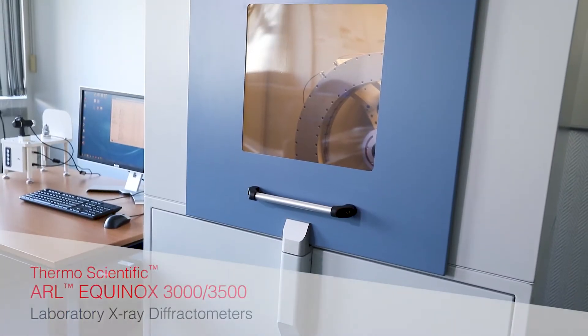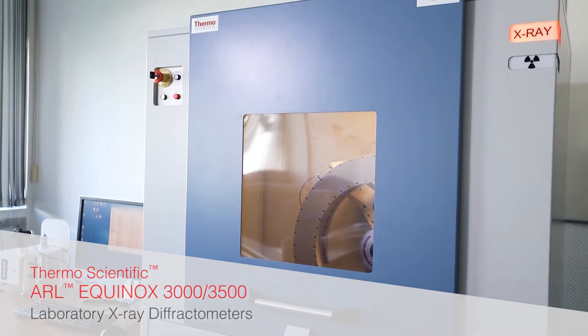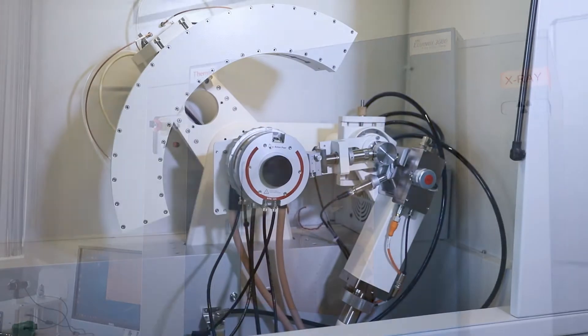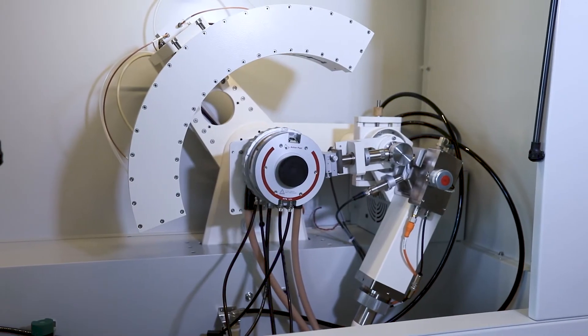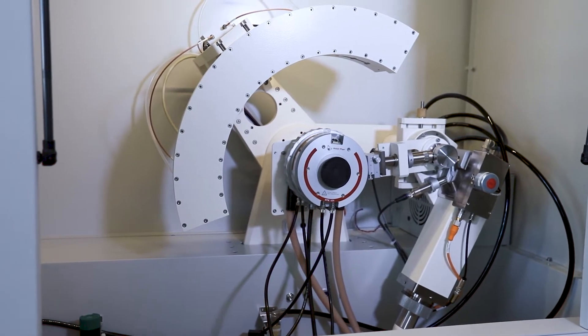The Thermo Scientific ARL Equinox 3000 and ARL Equinox 3500 X-ray diffractometers are designed to meet structural and phase analysis requirements in both industrial and research laboratories.